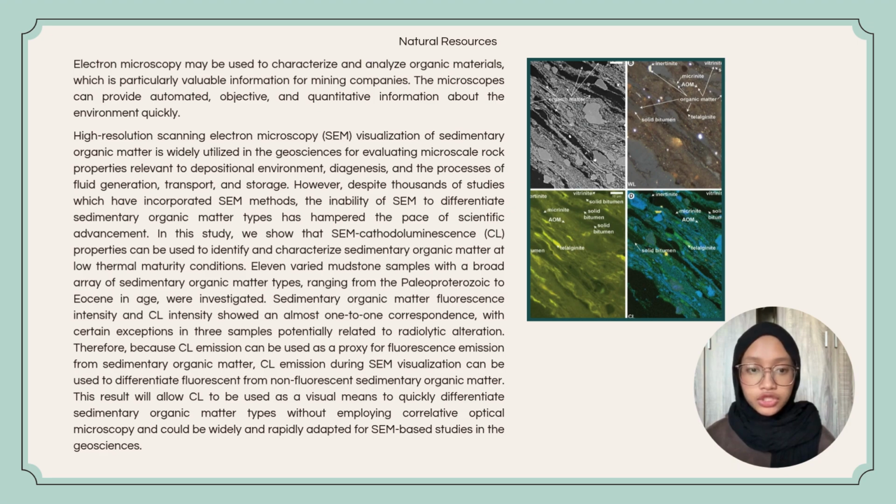High-resolution scanning electron microscope visualization of sedimentary organic matter is widely utilized in the geosciences for evaluating microscale properties relevant to depositional environment, diagenesis, and the process of fluid generation, transport, and storage.